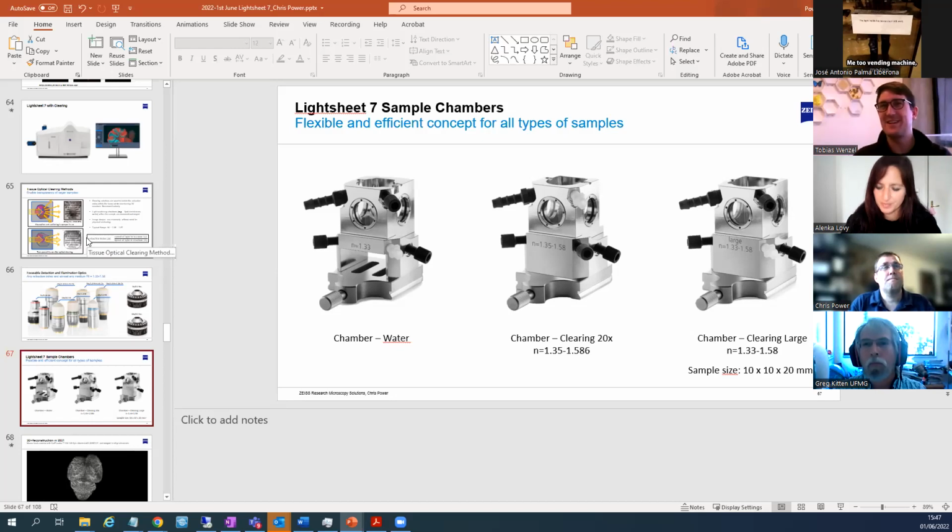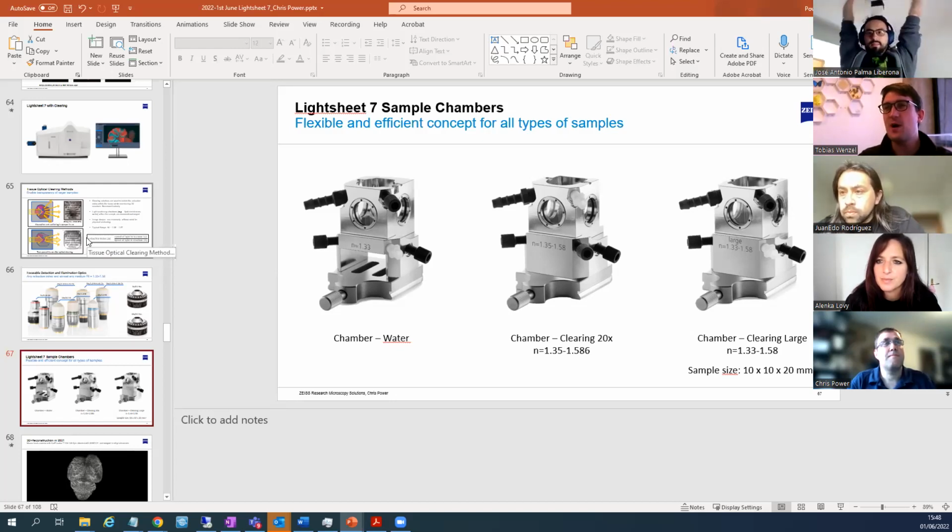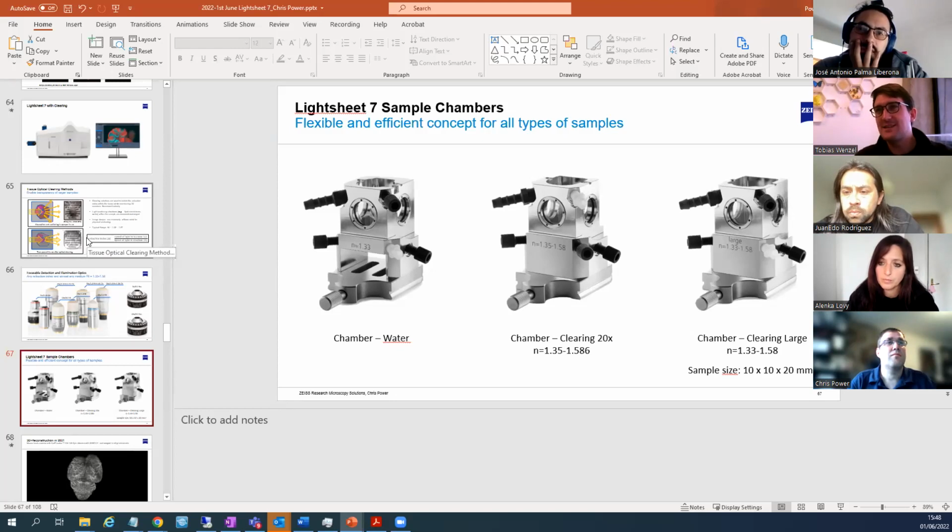Okay, thanks, fair enough. Thanks, Chris, for a very interesting talk. I don't have any personal experience yet with light sheet, but I'm very interested to try it out. And I'm wondering, why do people always use round capillaries? It strikes me that if you take a round sample and you turn it, you get a lot more resolution in the center of your sample, but it's not evenly distributed. If you would take a square-shaped cuvette and you would move it laterally, you would get more even sampling. Why is that not done normally, or what's the rationale behind that design?